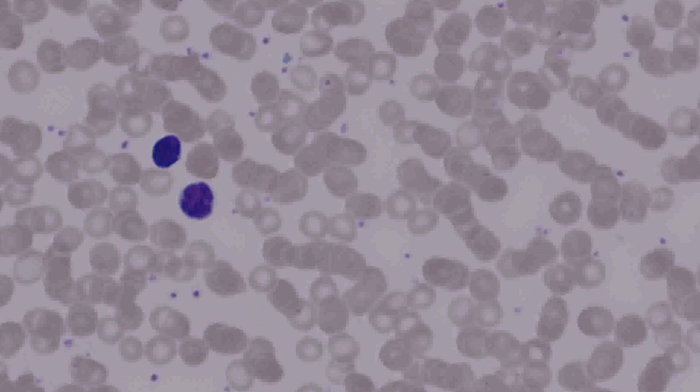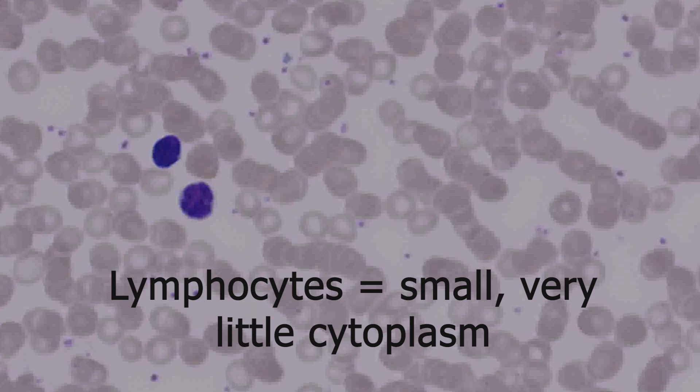Lymphocytes are small and they are almost all nucleus, with very little cytoplasm. My rule of thumb is that if you have a small cell that is 70% or more nucleus by volume, it's probably a lymphocyte.